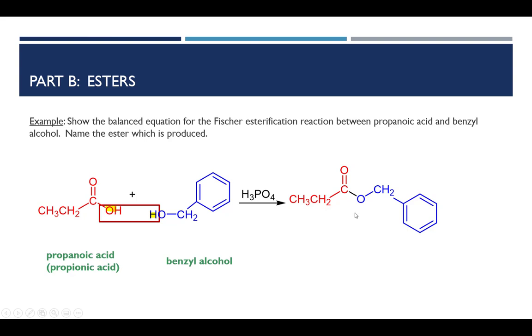And so this is our product. You'll notice I've color-coded everything to show where the atoms are coming from. And we also need water.